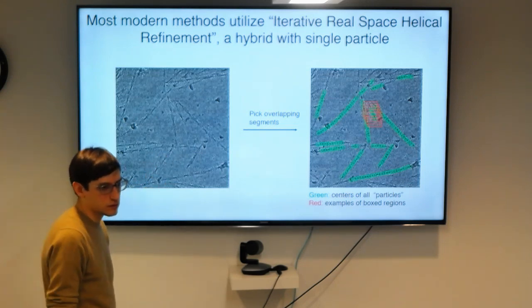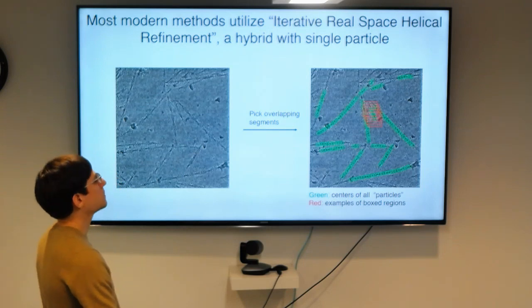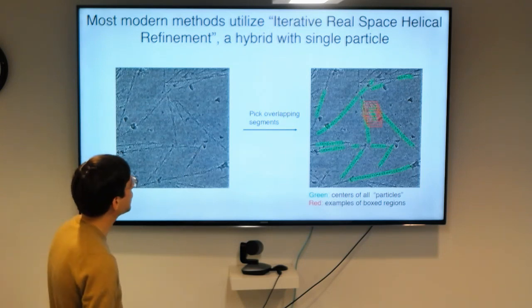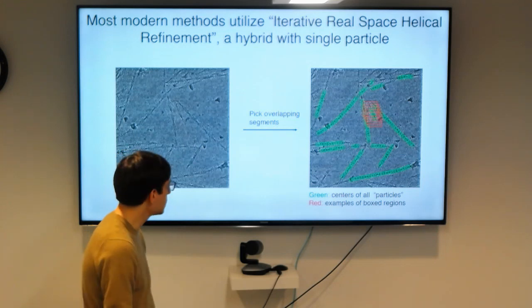So in this right image, all of your boxes and your little green circles that indicate each protomer, that's from information that you have previously. How do you choose where to put the boxes? So there's some debate about that in the field, actually.